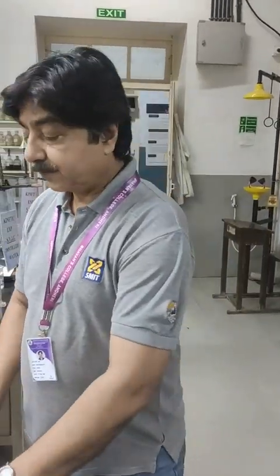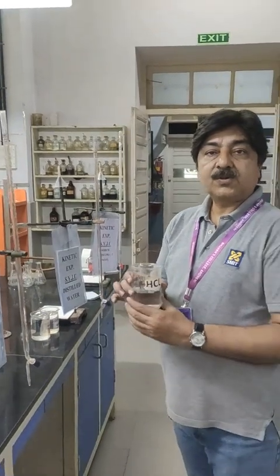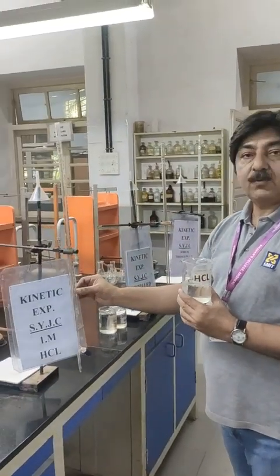Today we will be performing a practical experiment which is given in your board's handbook on page number 13, experiment number 3: to study the effect of concentration on the rate of reaction between sodium thiosulfate and hydrochloric acid. Let us have a look at the requirements. We should have HCl solution whose molarity should be 1 molar.